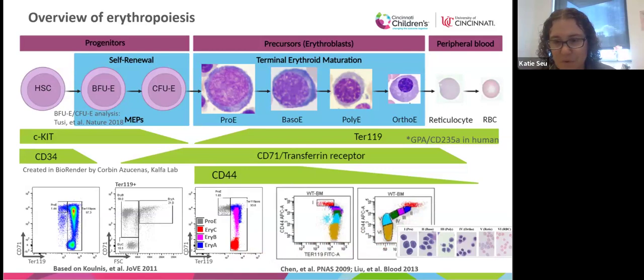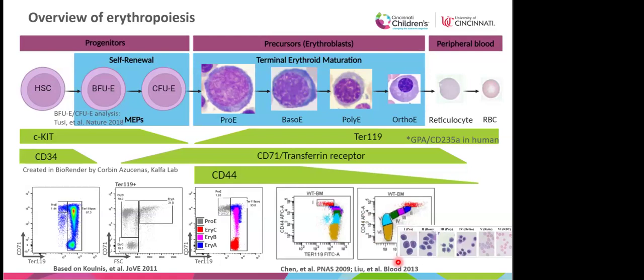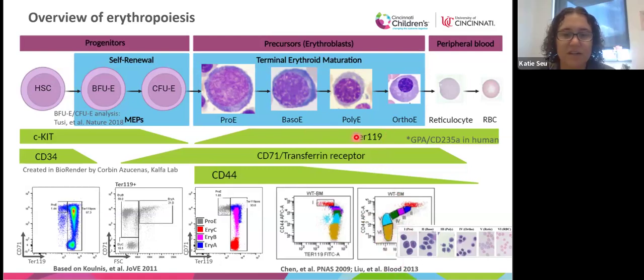So with that said, this is sort of the point that I'm going to lead into with the imaging flow cytometry, is that we still don't have any other markers. Even to optimize this flow cytometry analysis, we had to harness their change in size, which is a characteristic morphological change that these cells undergo.